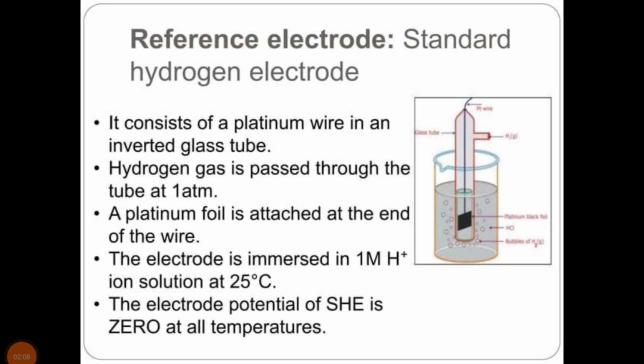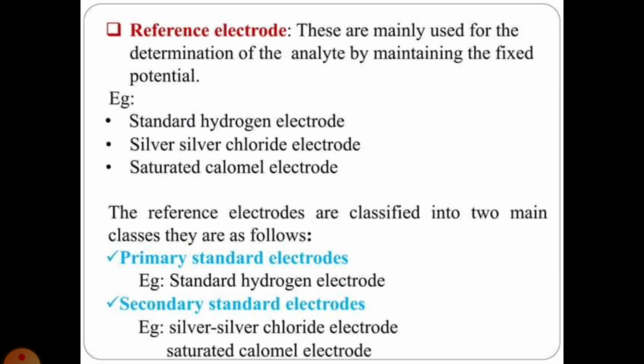In today's class, I discussed the following types of electrodes and the theory of potentiometry.